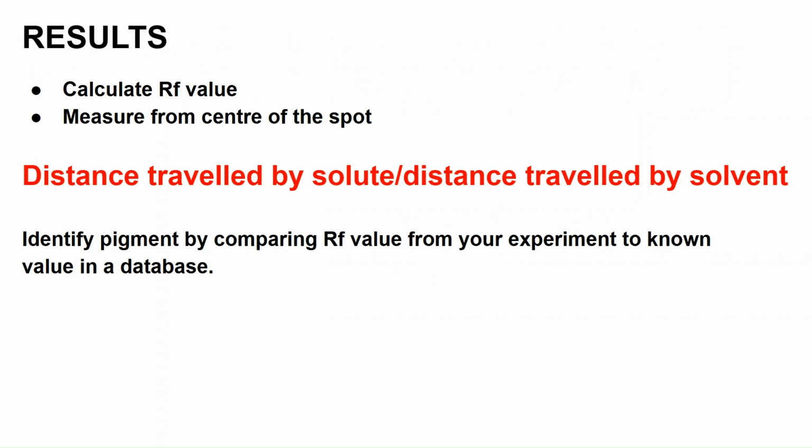And how you identify your pigment is by comparing the RF value from your experiment to a known value in a database.